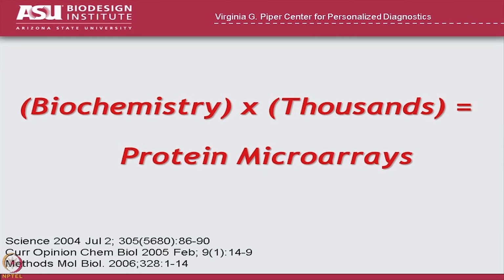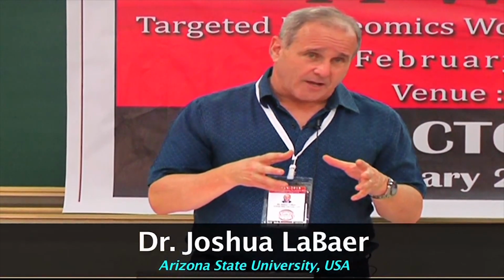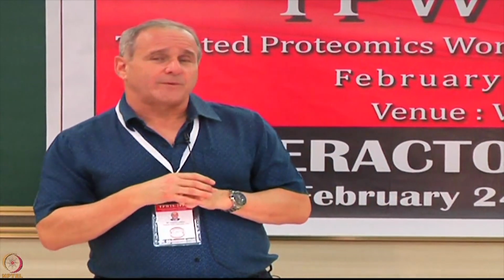And just to give you some perspective, when we first began this work, we actually started by trying to do high throughput protein purification. And so we were developing methods to make proteins in bacteria, lyse bacteria, capture the proteins on columns, elute the proteins, and then study them in high throughput. And believe it or not, we still do some of that work for other reasons.